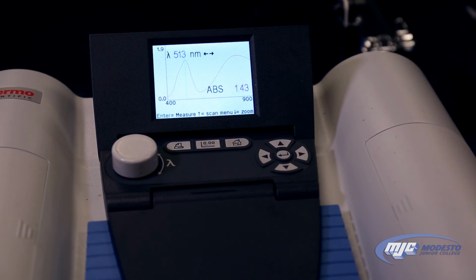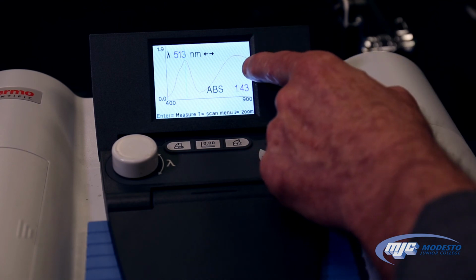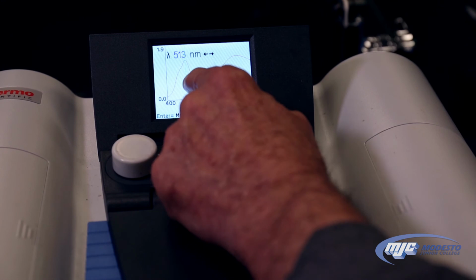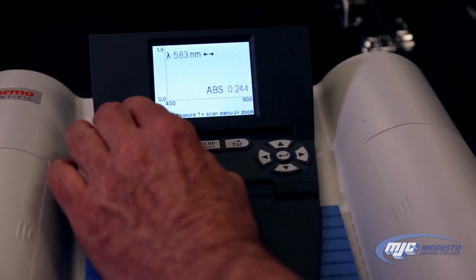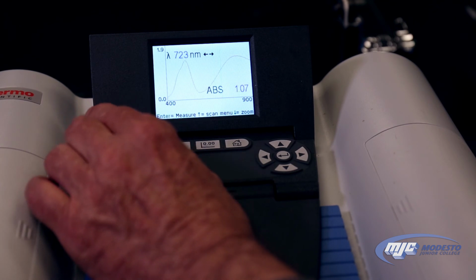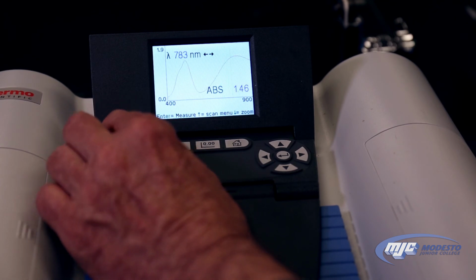We're going to write that down in our data table, and now we're going to do the same thing for the copper ion, which is this peak right here. So we turn this knob, get that green line somewhere around the max. Now with this one, I have a feeling we're going to see more than one wavelength that gives the maximum absorbance. We just kind of go to the middle one.